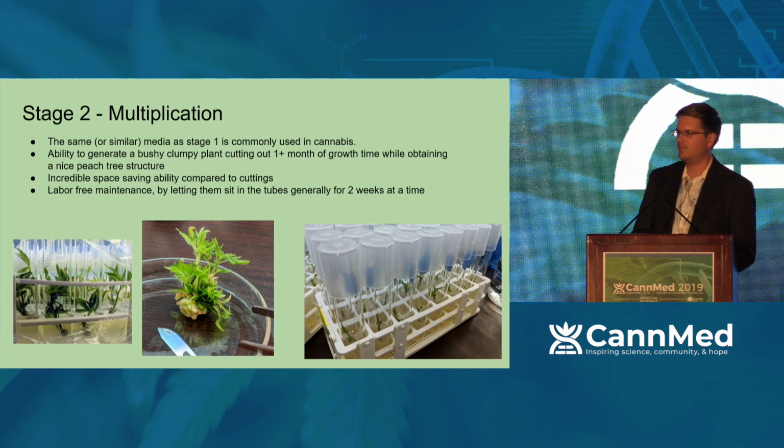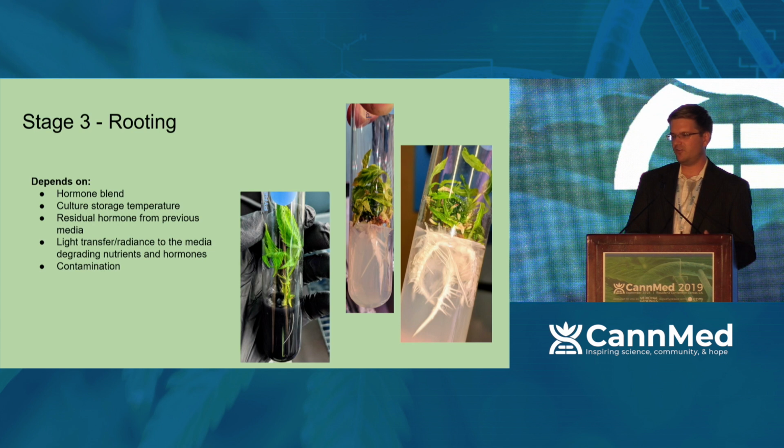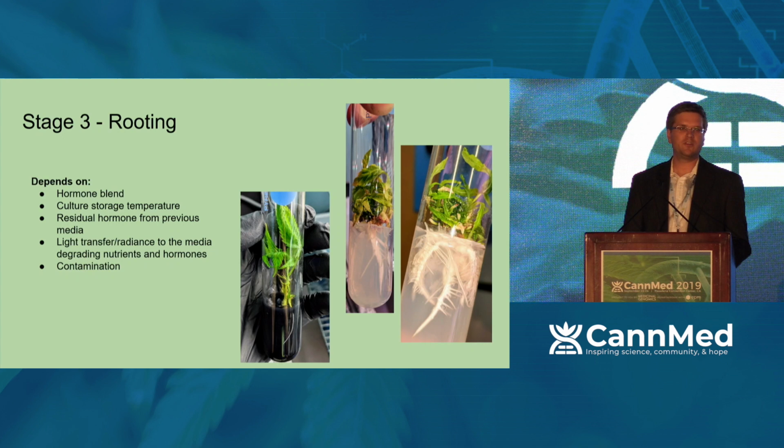The third stage here is the rooting stage, and this is one of the big stages that I'm going to touch on here in a little bit as well, but it just depends on your hormone blend, the temperature fluctuations of your culture, and some of the contamination that might happen with some of these cultures. Sometimes you'll have weird contaminants or endophytes that don't want to come out in the media, and once you start rooting, you'll actually see some of the roots degrade because they have endophytes that only like living in the root system. I mean, it makes sense. Plants are like icebergs. They have more mass on the bottom a good majority of the time.